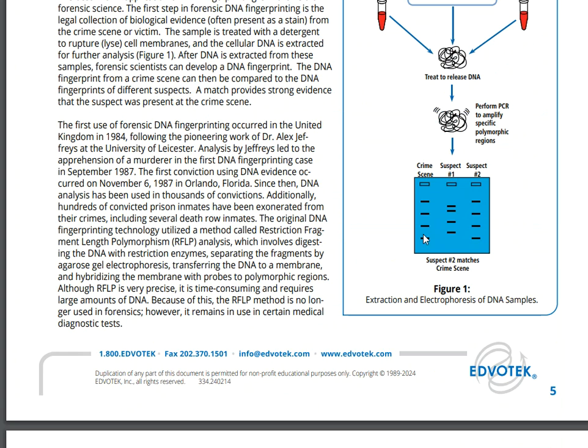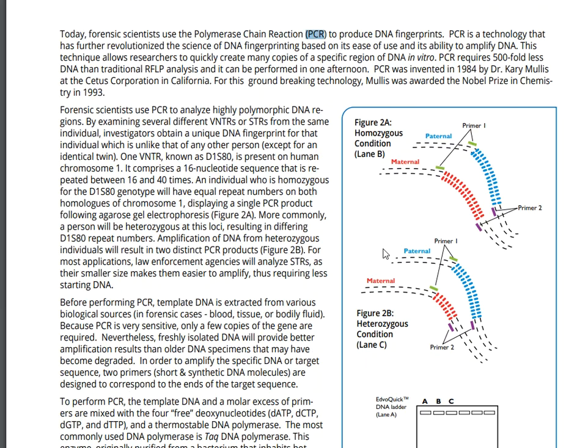If we can keep this a little bit clean, then we can compare them much easier between each other. But the more fragments that we have, the harder it is, and the more work that's going to involve in order to play match game or figure out who the mother and who the father is. So these are things that we need to maybe think about, and we need to limit the number of fragmentation cleavages that we get from these DNA samples.